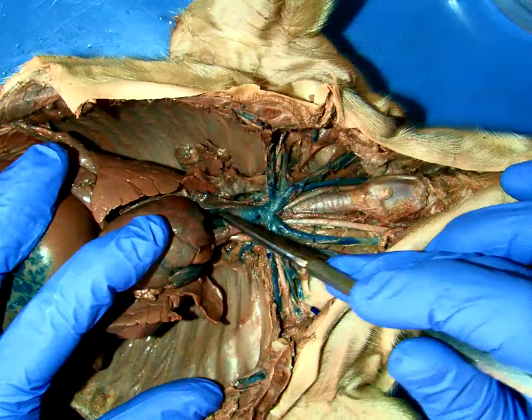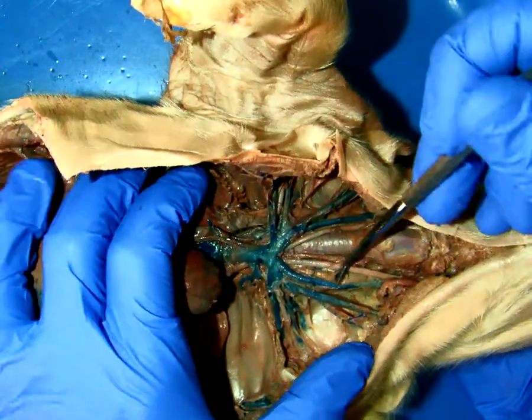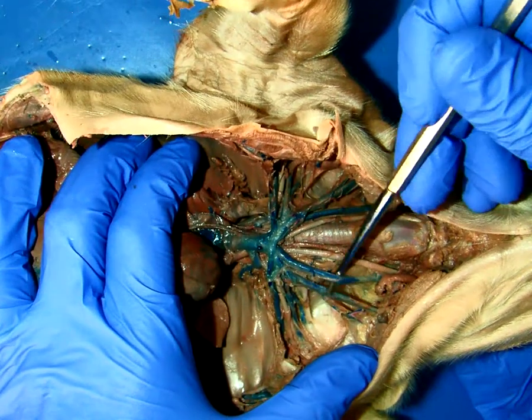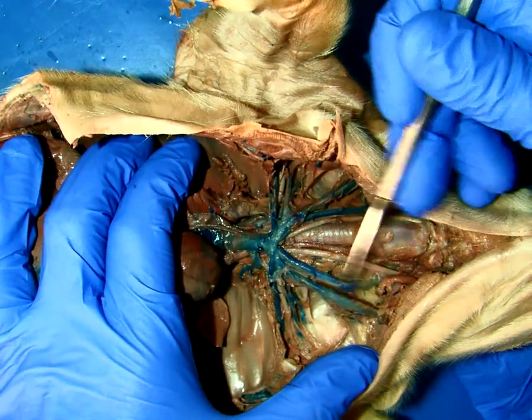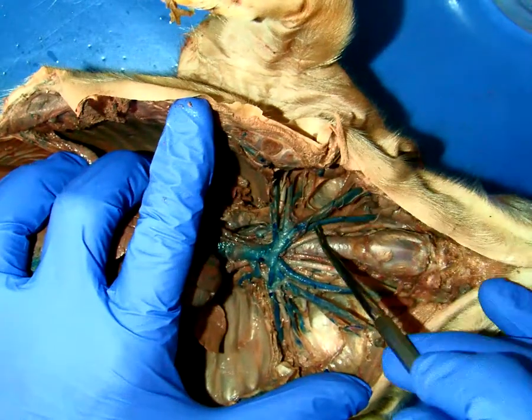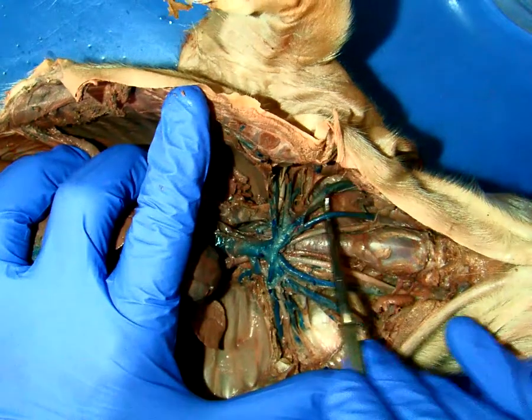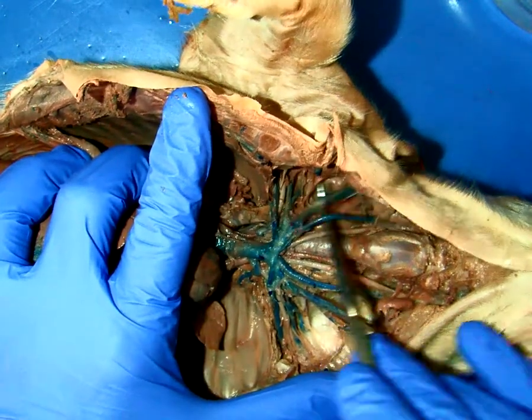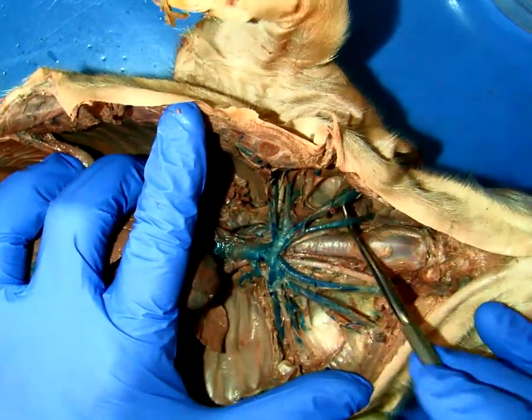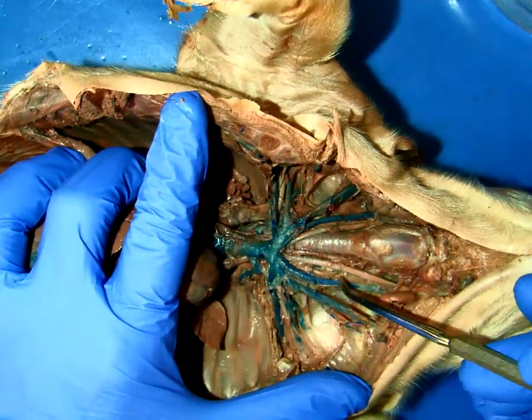The veins, of course, drain the head. So what you probably have here is an internal and an external jugular running side by side. That would be my guess. I'd have to trace them up here, but I think these are probably the internal and external jugulars. For all intents and purposes, just judge if it's deeper in the body cavity, it's probably the internal.